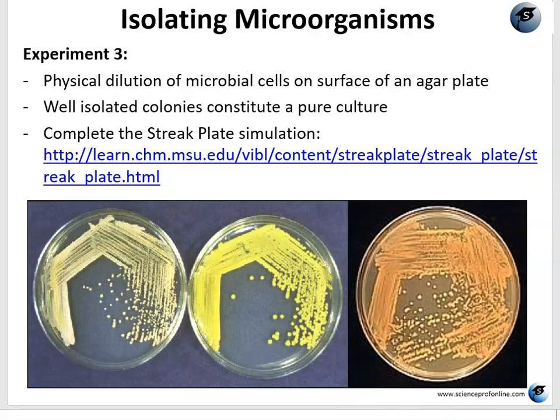Experiment 3, you're going to be doing a simulation. And this is because we have a BSL-1 limitation for the online lab. I couldn't send E. coli and M. luteus or other organisms home with you, so what you're going to be doing instead is a simulation. It's a streak plate simulation where you will get to do the technique virtually, and it's found here at this URL. And in fact, I've got a little short clip here for you, kind of showing you what that will look like.